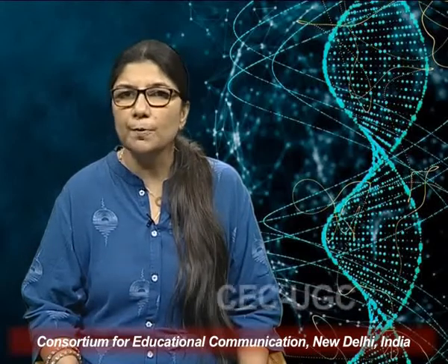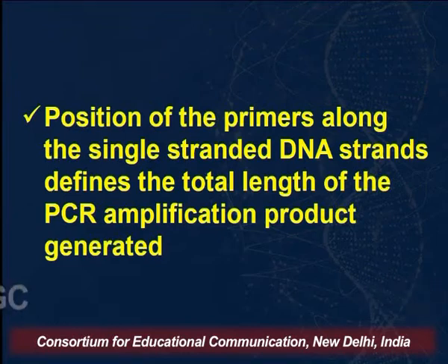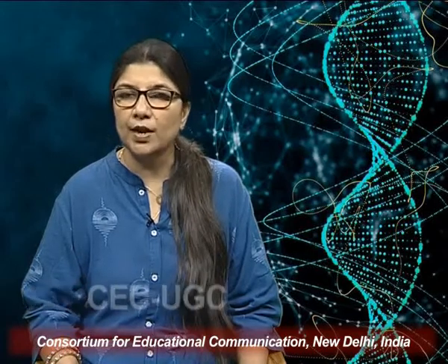The position of the primers along the single-stranded DNA strands defines the total length of the PCR amplification product generated. I told you that for a particular PCR reaction, we use a set of primers, a forward primer and a reverse primer.